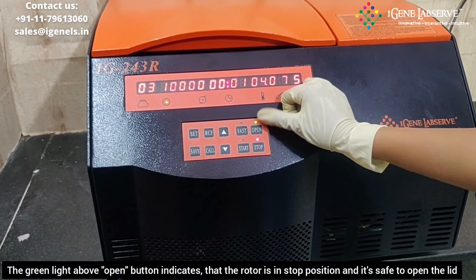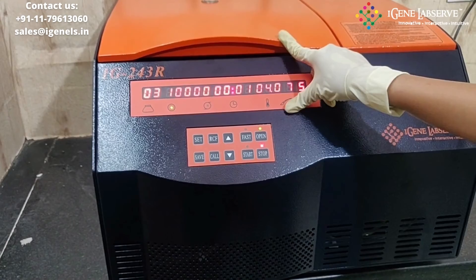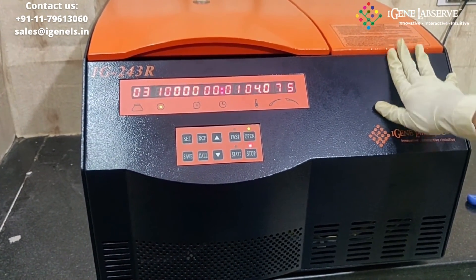This light here indicates that the rotor is in a stopped position and it is safe to open. So this is how IGN's refrigerated centrifuge works.